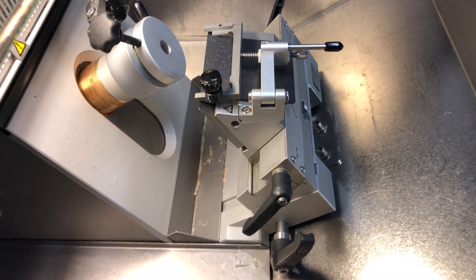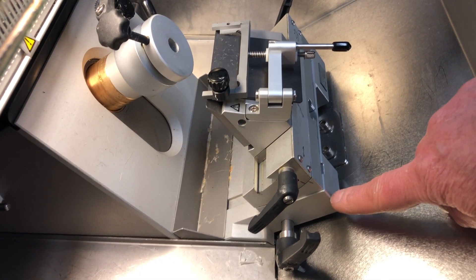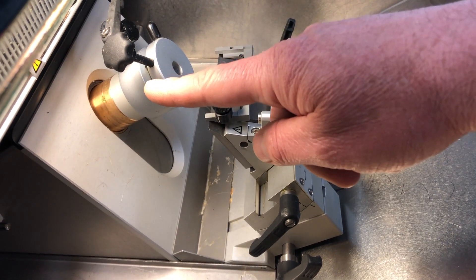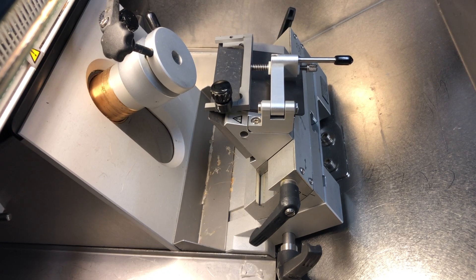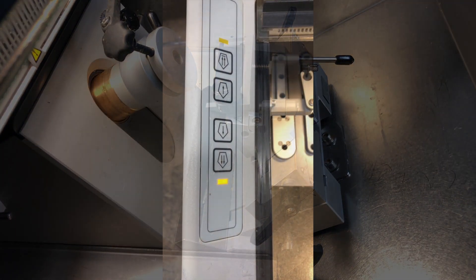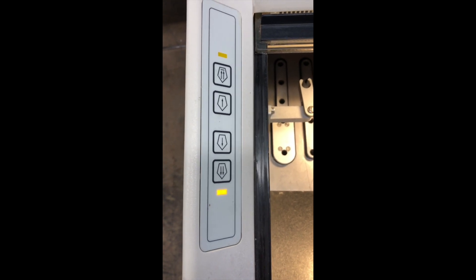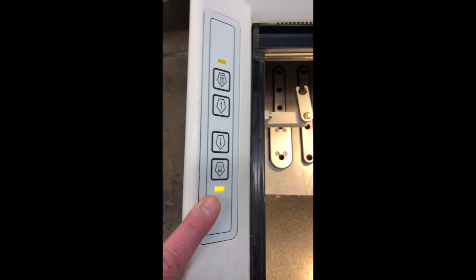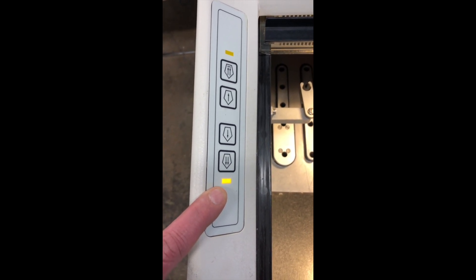Here's a view from the side of the microtome in the cryostat. As you can see, the knife holder is all the way out. That means the object holder is all the way out, so it's at its limit and it's not going to move any further. Here's a view of the advance and retract buttons on this cryostat — you'll notice this light is on right now. This is the full advance light, meaning the object holder will not move any further.